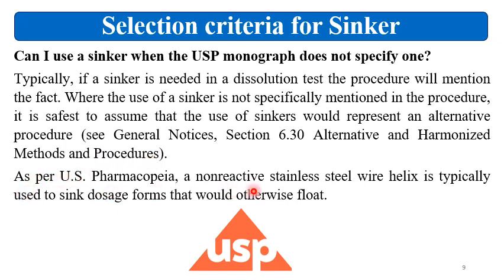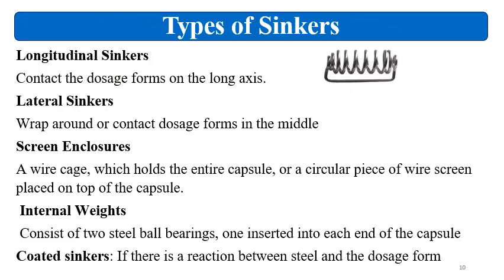As per the US Pharmacopoeia, a non-reactive stainless steel wire helix is typically used to sink the dosage form that would otherwise float. So the simple answer to this question is yes, you can use sinkers, and if required you can correspond with the regulatory authority. But generally sinkers can be used. Their use can be and should be justified.